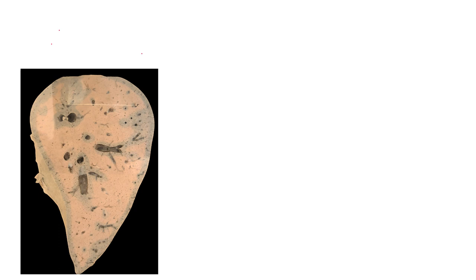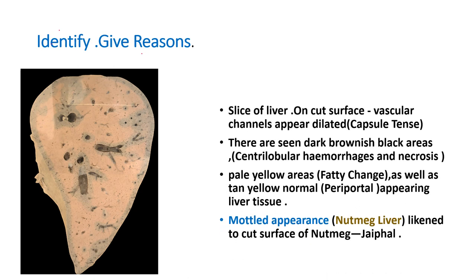This is a slice of the liver, and in contrast to the previous specimen, you see prominent vascular radicals or vascular channels on the cut surface. The capsule here is also tense and glistening. There are areas that are blackish-brown, predominantly around these dilated vascular channels, which are the centrilobular areas or around the central vein of the hepatic lobule. This blackish-brown color is due to hemorrhages and necrosis.